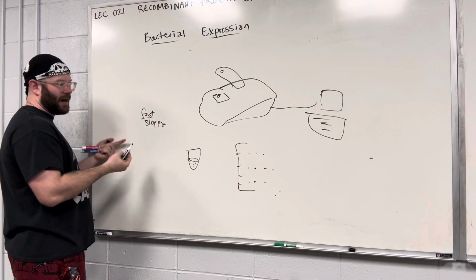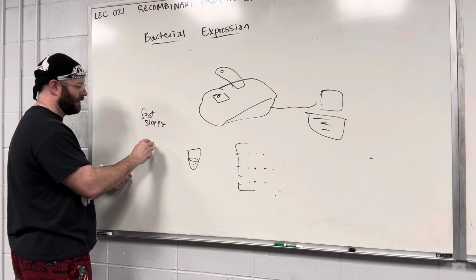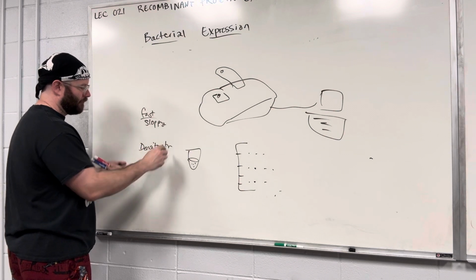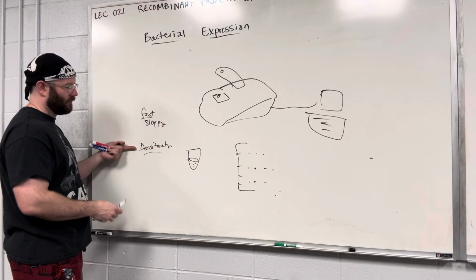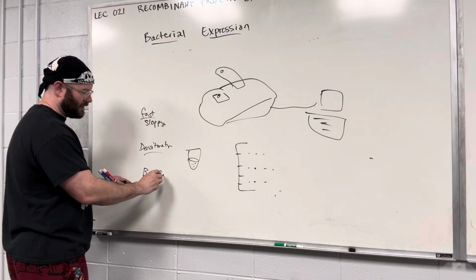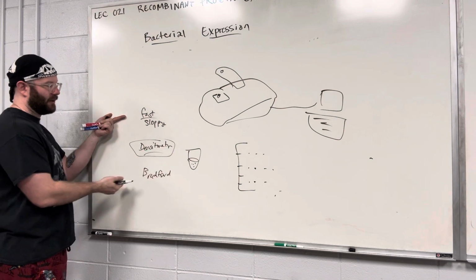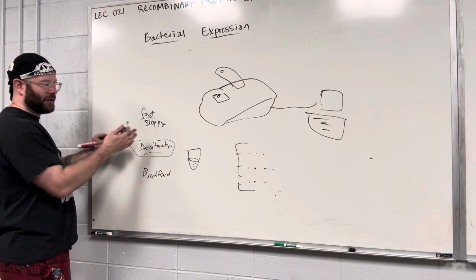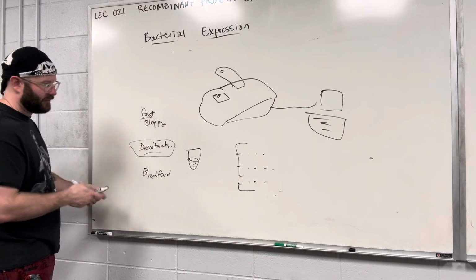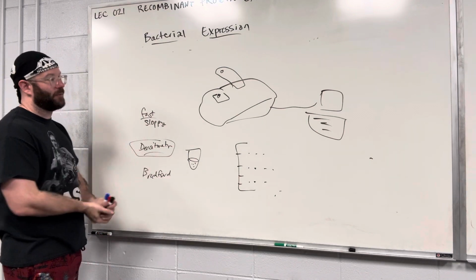In my experience, in my hands, the best, most accurate way is actually densitometry. But because this involves running a gel, many people will often do the Bradford. So each of these has pros and cons. I think this one is actually the most accurate. But you can do multiples, or sometimes people will even do mixtures. Okay, we can end there. That's the gist of recombinant protein expression.